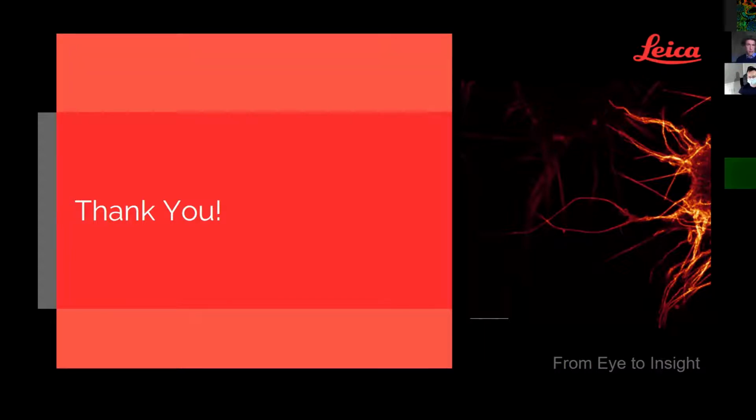And in classical intensity-based STED, you try to achieve that by either going to higher depletion laser powers, which then make that volume simply smaller, or also to use the gating functionality to cut off very early arrival times, which then mainly removed the uncorrelated background from the image. So you simply had no other means apart from these two things.